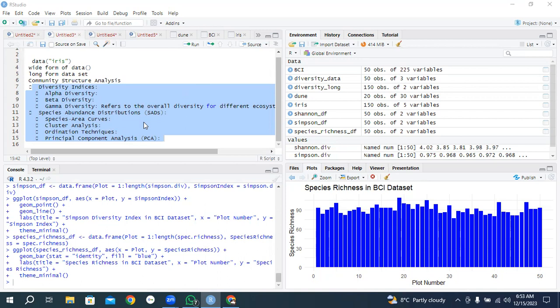Do you have any questions about today's class? No. Okay, thanks. Practice on these given analyses. We'll take one or two more classes, and then we finalize our batch. I think you have got about 30 to 35%.